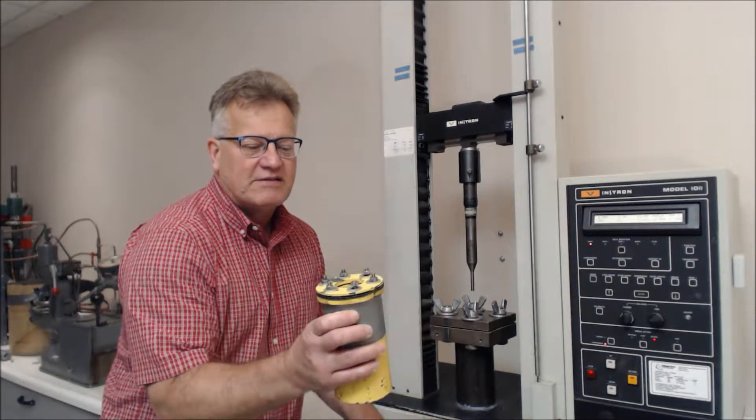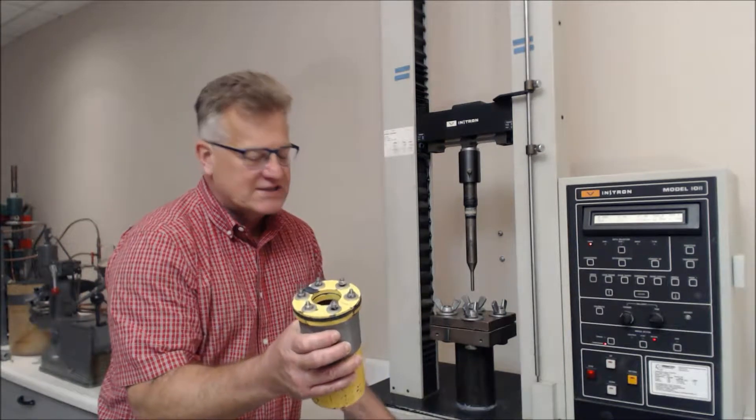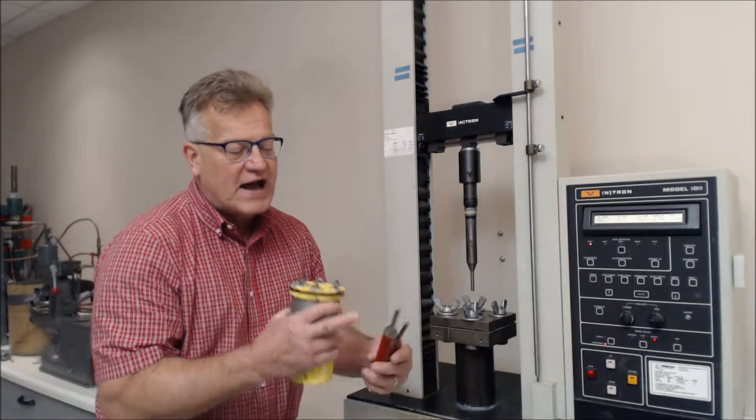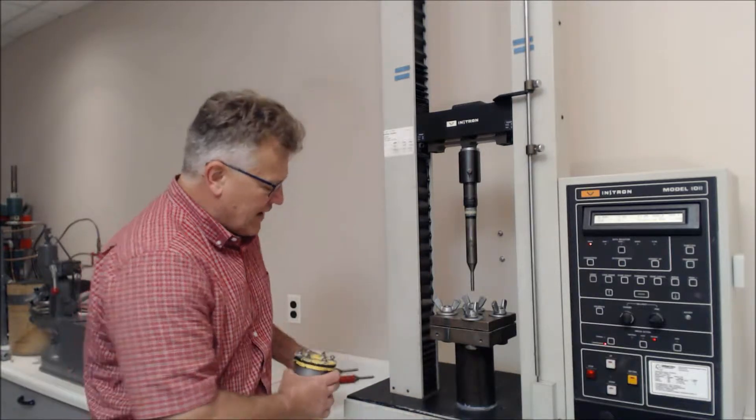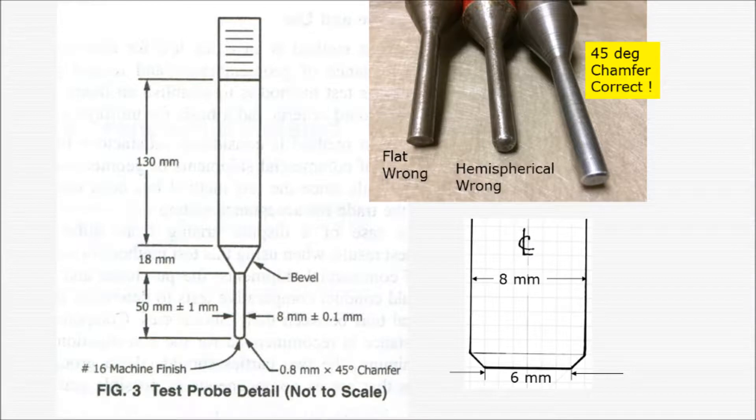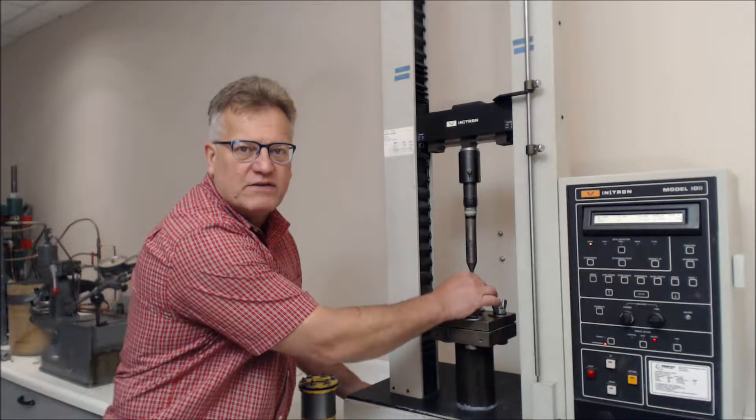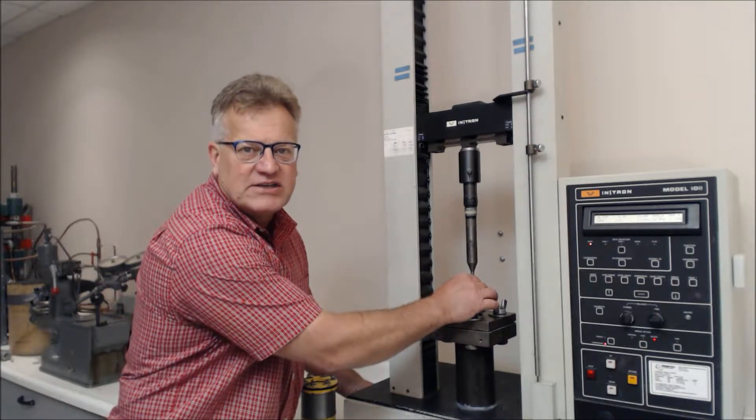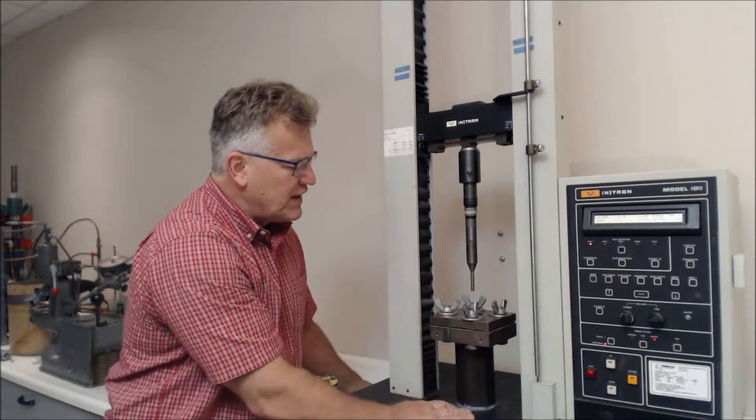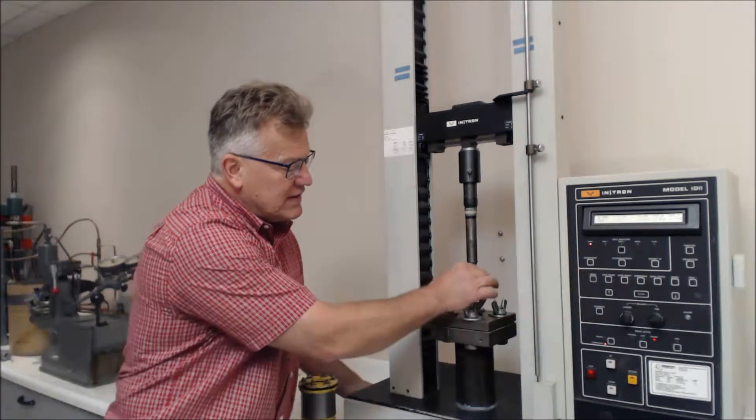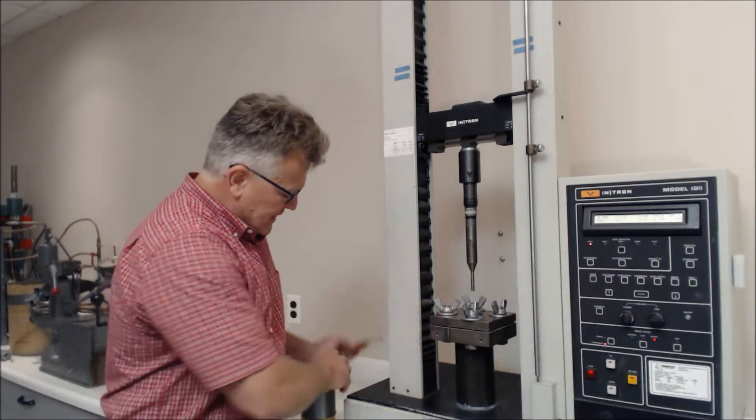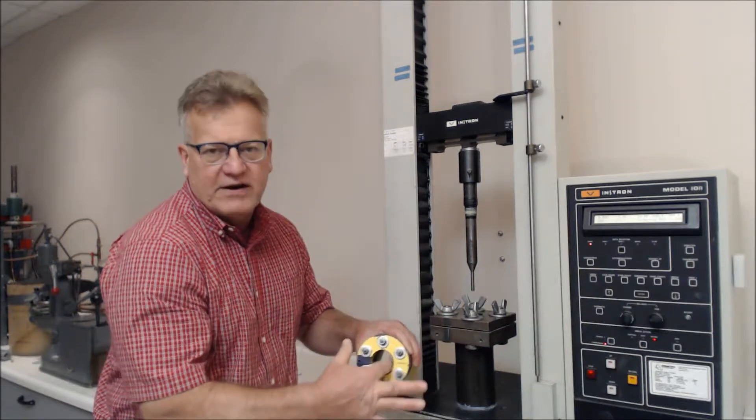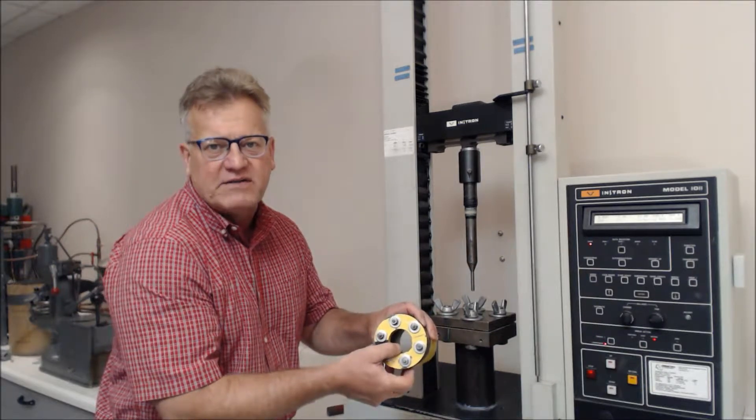This was the device that we used originally in the standard with the probes. The probes are not hemispherical or flat tip like this, but they're at a 45 degree chamfer, and the machinist has to machine that according to the specification within the standard, and we'll show that to you later. The diameter of the probe is 8 millimeters, and the opening here is 45 millimeters in diameter.